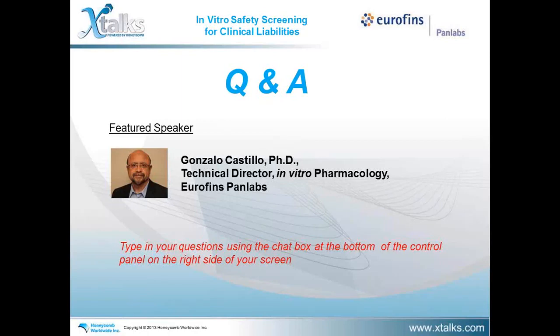Okay, great, thank you. Our next question here: can you elaborate on how you determine the safety margin for HERG? Safety margin? So that is a good question, and I'm going to try to give you my best answer. I just want to make sure that I'm understanding the question correctly. So the question that I'm going to answer is, let's say you have your potency and you have a hit, right? You have an adverse event related to one target, and you have the affinity of the target of interest. What is the safety margin?